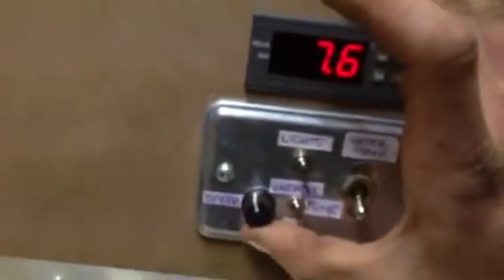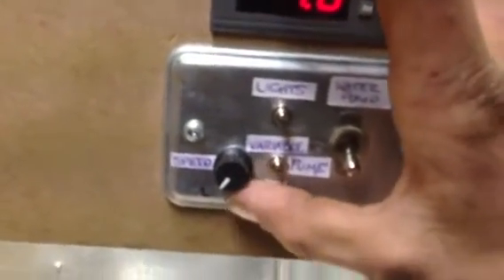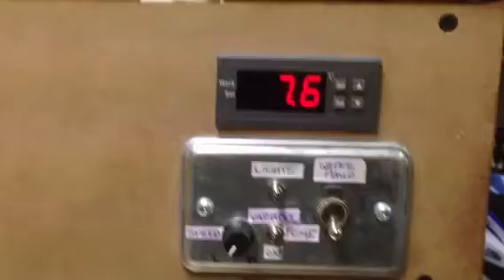But with the variable speed I can crank this up and the speed will also go up. I can adjust it to whatever I want — from probably about 75 CFM all the way up to 400, if not 425.